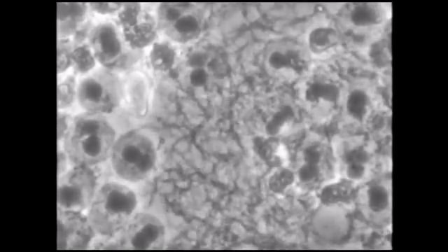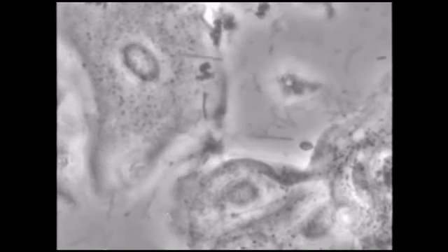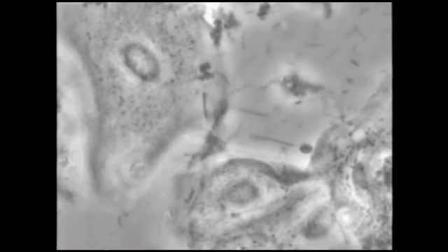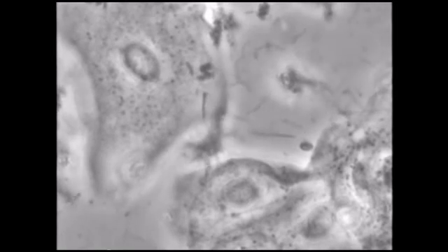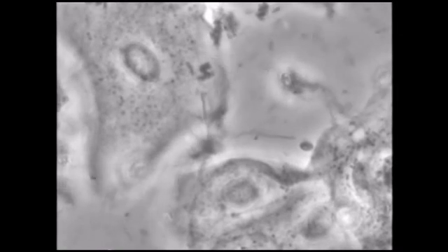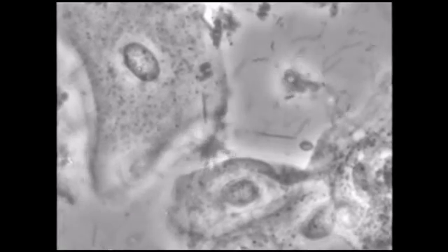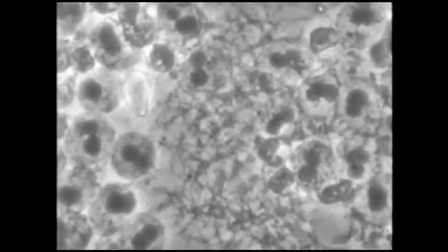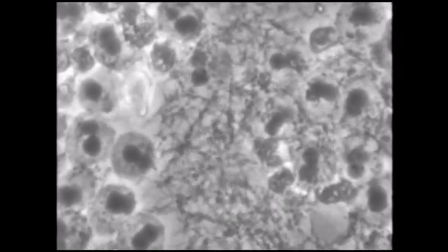Spirochetes show group intelligence. You do not want smart bacteria. Here they have ganged up on a white blood cell. When you take the bacterial sample from the patient, you'll see thousands of spirochetes all biting a white blood cell. This shows organization. When they get too crowded, they'll all line up on one of the non-motor rods and begin to beat together and make a heartbeat. So they create their own circulation and pack more spirochetes into a smaller area.